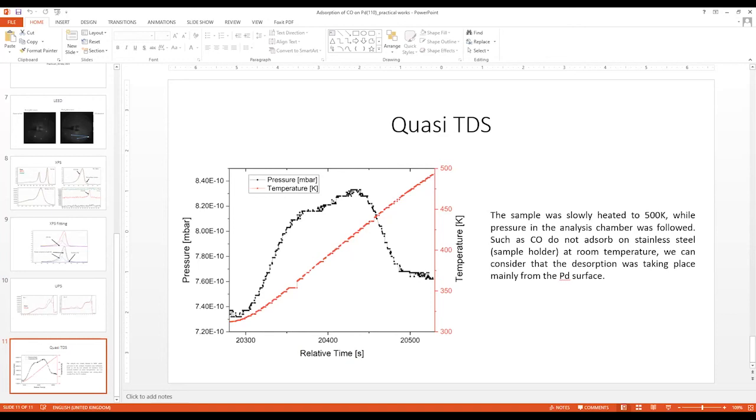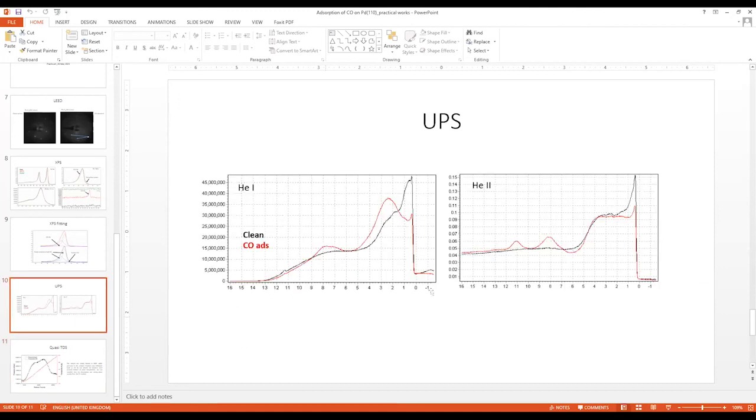However, it is not yet useful for helium-1 measurement, but for helium-2 it works. The aluminum layer with a thickness of 100 nanometers is transparent for photons with energy 40 eV. So we would like to install it soon.